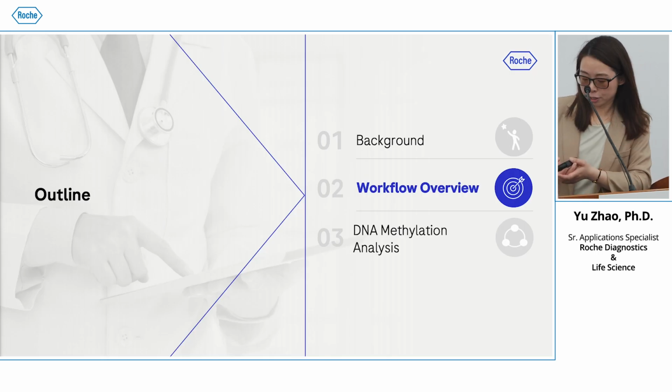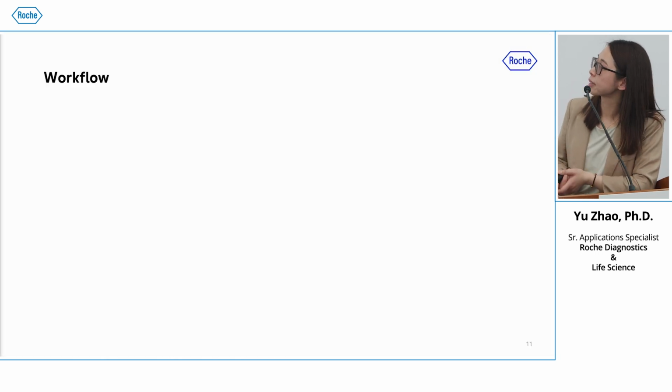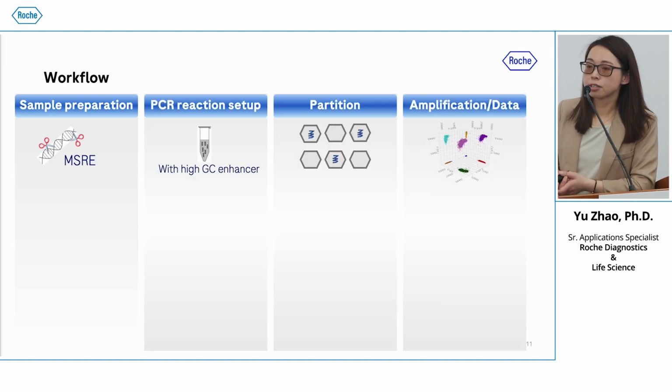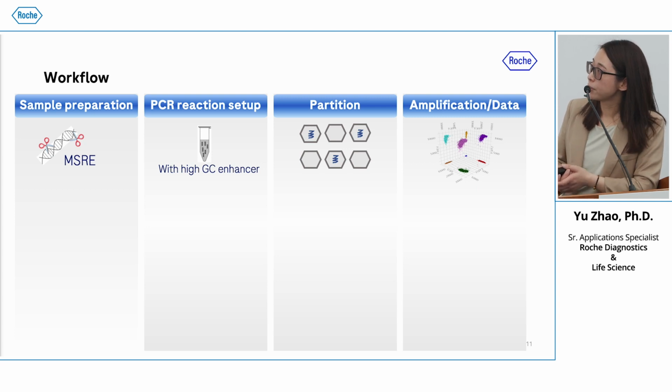Let me walk you through the workflow. Begin with the sample preparation. This step involves enzyme treatment, followed by PCR reaction setup, supplemented with high GC enhancers. I will get into this process shortly. Then proceed to partitioning and endpoint data collection.